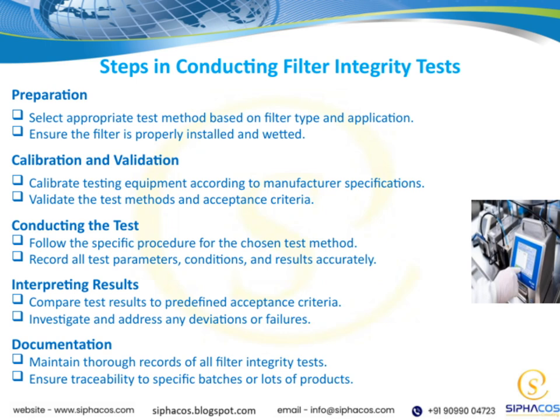Adherence to the protocol is key to obtaining valid data. Be meticulous in recording all test parameters, conditions, and results. Every detail counts, as it supports the integrity and traceability of the testing process.